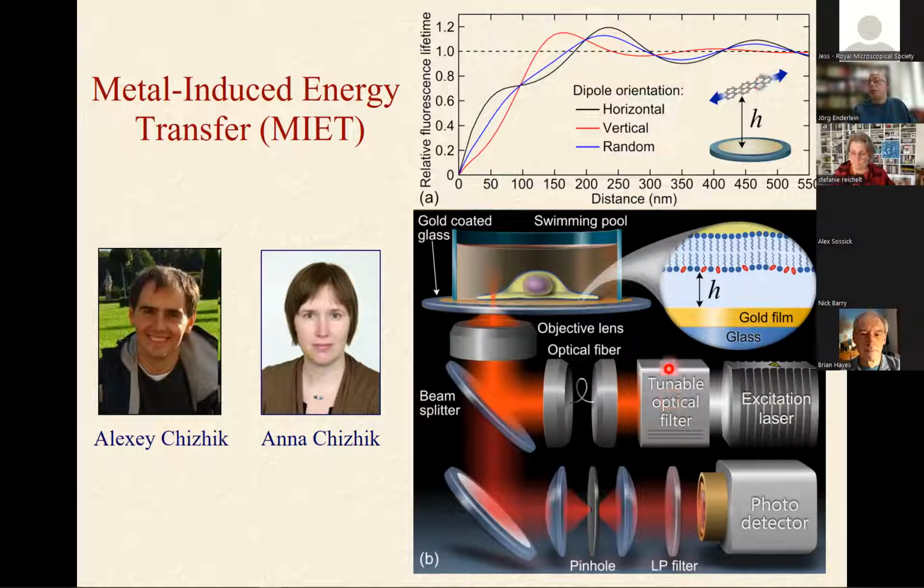And then we have an optical tunable filter for picking the right wavelength. So this is a white light laser, and here's simply a wavelength filter. Then we focus the light into a very tiny spot onto our sample. And then we scan. We have a scan unit. We can then scan our cell here.